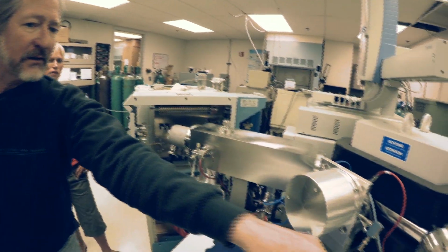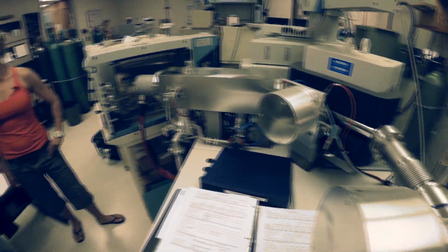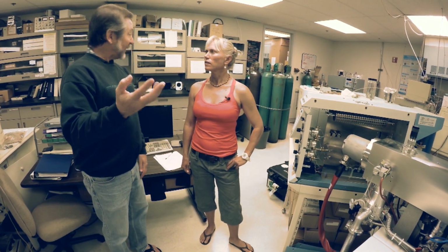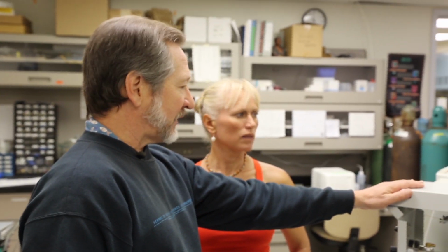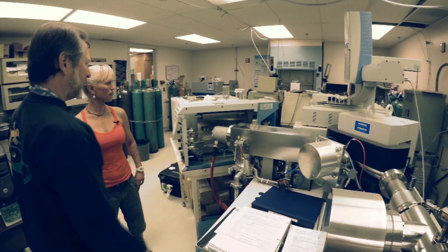They then get focused into something that detects those ions, and we can measure a ratio from those, the ratio of the nitrogen gas containing the heavy isotopes to the nitrogen gas containing the light isotopes. So the mass spectrometer creates the ions, separates them, and eventually allows us to measure a ratio. All of this is sort of one instrument, but the mass spectrometer is a little bit different, and this is kind of a preparation system. We can put any kind of preparation device we want onto a mass spectrometer.